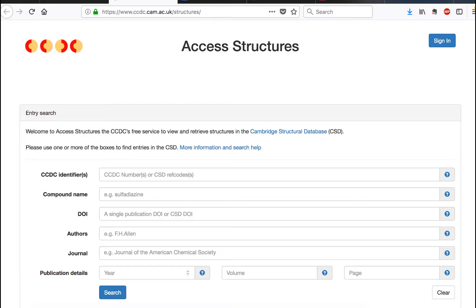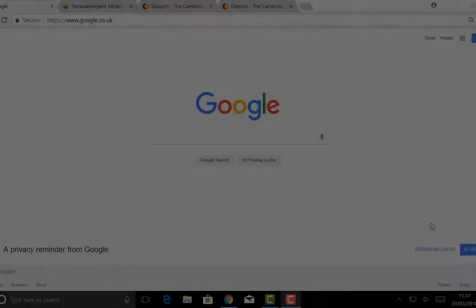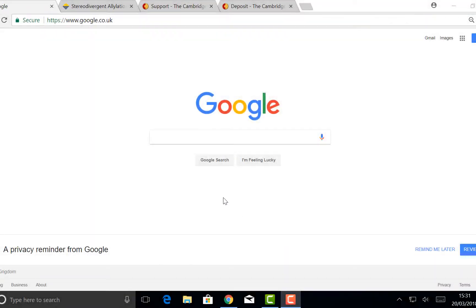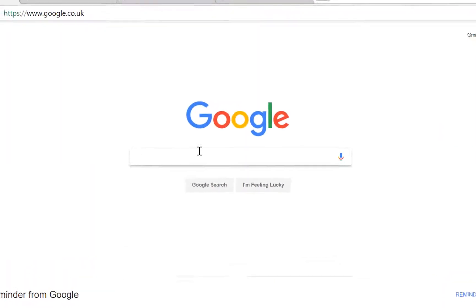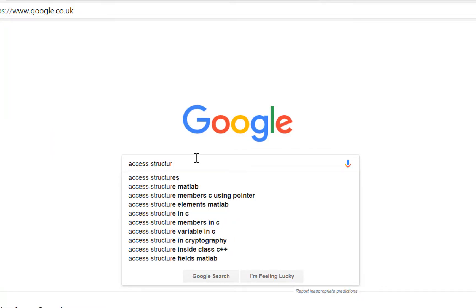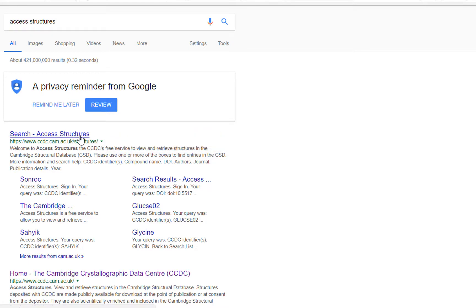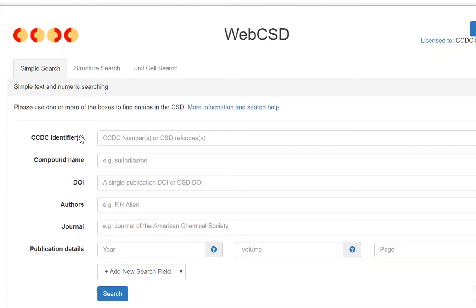So firstly, let's get to the web page. I'm starting with a Google search for Access Structures. Here you can see it's the first hit with the web address of www.ccdc.cam.ac.uk forward slash structures.